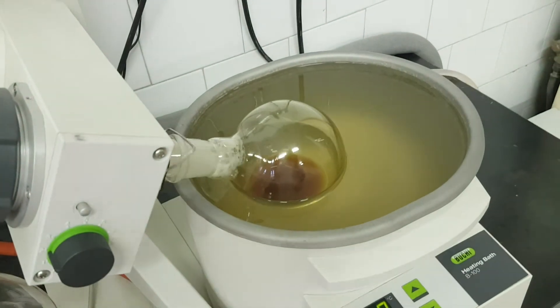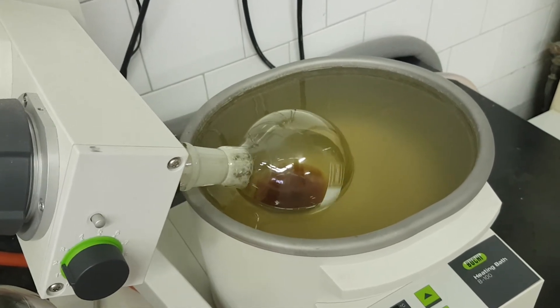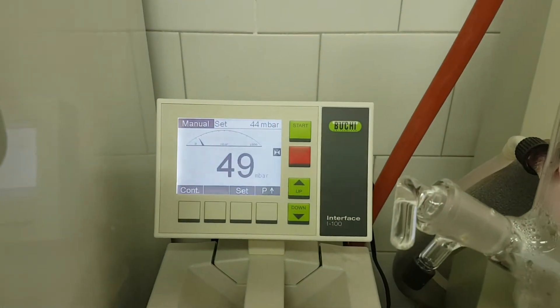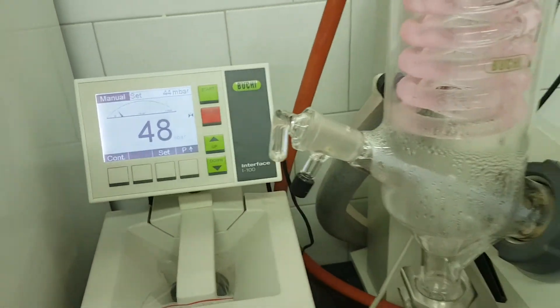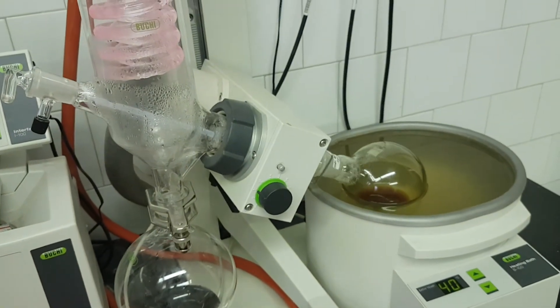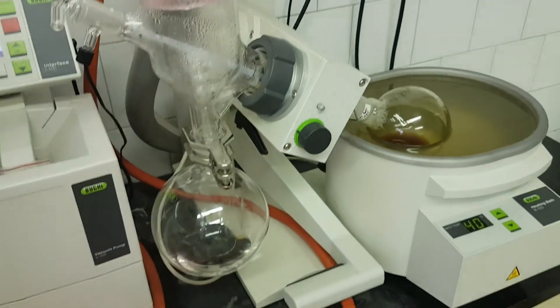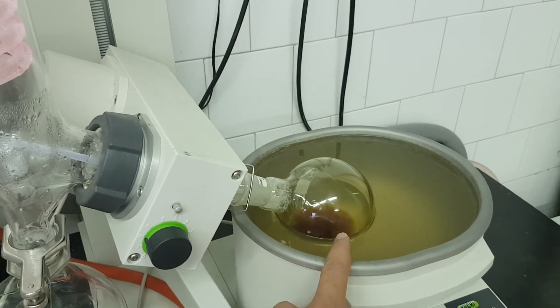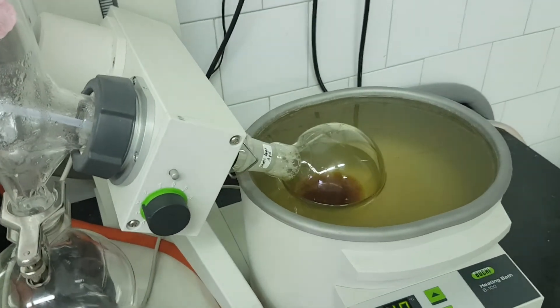Wait about five minutes. If there are no bubbles, decrease more — only one or two at a time, it depends. But if you go down very quickly, you will not evaporate your water properly, and you will be struggling, confused about what's going on. It takes a lot of time — sometimes to evaporate 30 ml of water you will need maybe two hours.